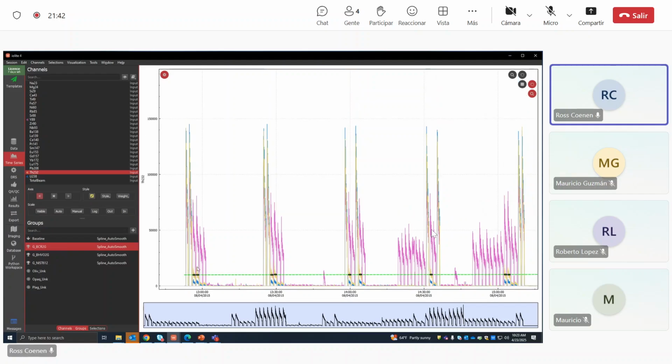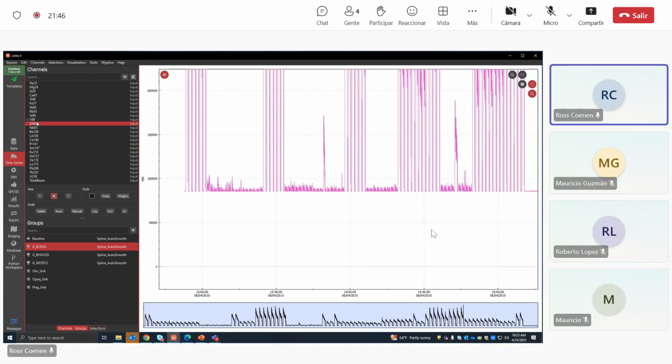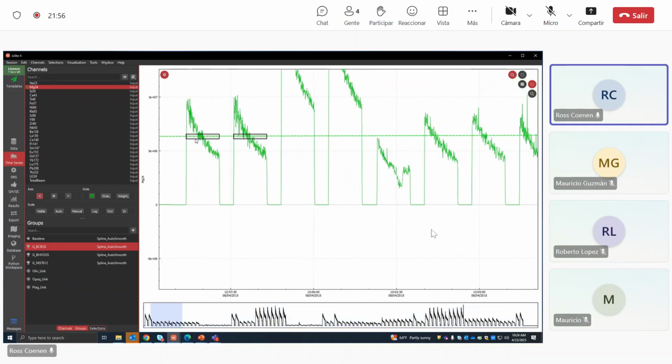And if you find that maybe it doesn't line up, or you're getting some weird data that you don't want to be included in your selection, you can always shift and select and adjust this how you want.